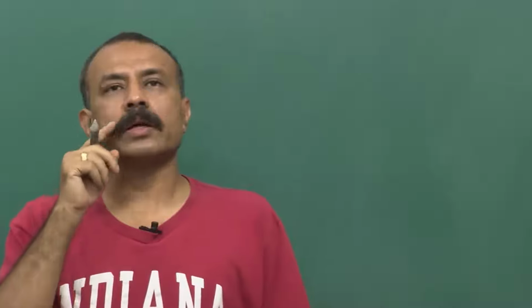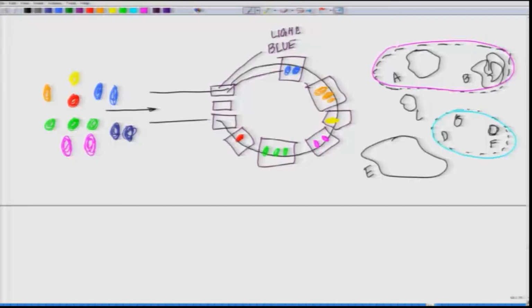Based on that code, there are sentries standing here who will tell you, okay, your sitting spot is here, or yours is here, wherever. At the microscopic level, these sentries will be replaced by specific probes.